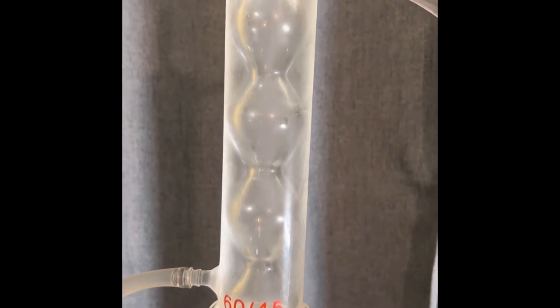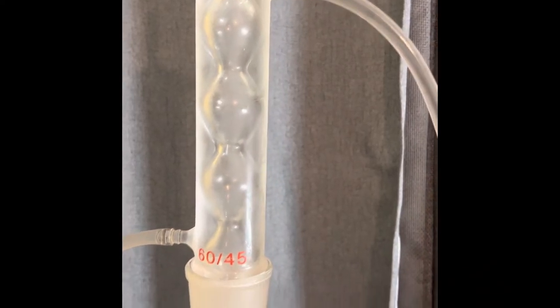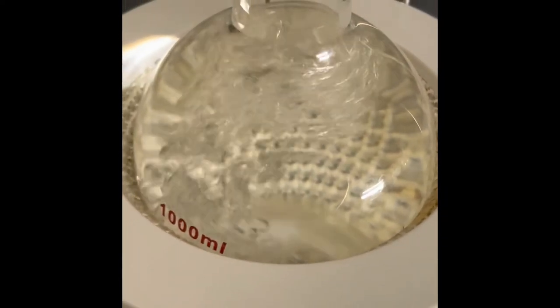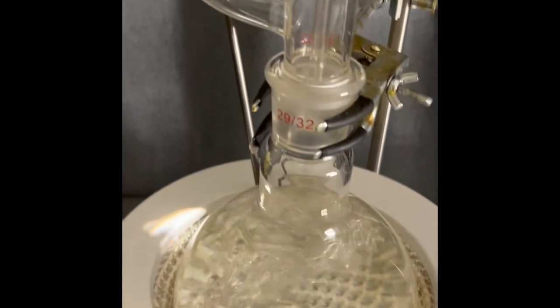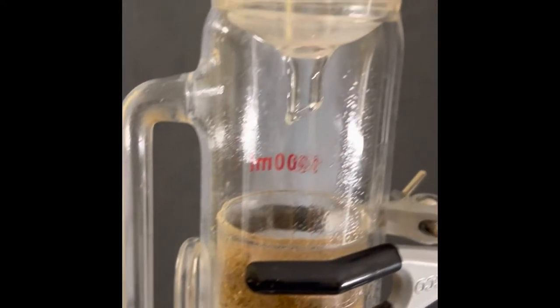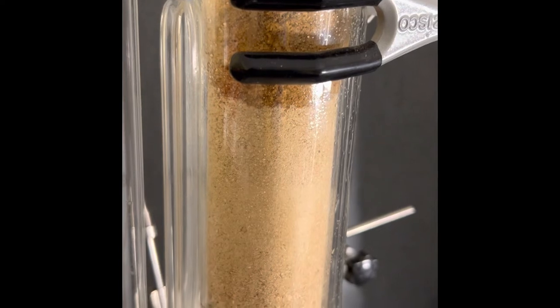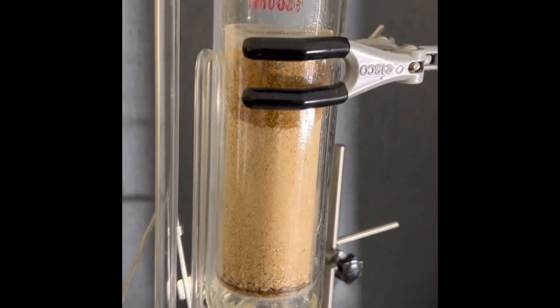The cold water is already chilling our condenser. That is condensation, hence the name condenser. And we're up and rolling. So as you can see here, we're hot now. So this hot gas, evaporated ethyl alcohol, comes up through this condenser tube, hits the condenser with the cold water, turns it back to a liquid, drops down into your thimble, soaks your organic matter, and I'll show you the next step when we're ready.